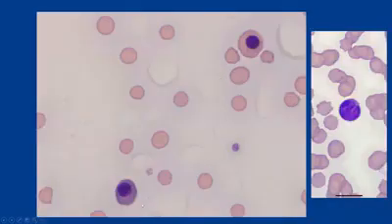All right, so we've got two of these right here. This is an example of a typical small lymphocyte from a cat. It is about the size of a red cell. It has scant basophilic cytoplasm, so not a lot of amount, and a slightly eccentric, round to oval nucleus with fairly clumped chromatin. Then we have these cells, which have more cytoplasm than our typical small lymphocyte. They've got a very dense nucleus that I can barely see the characteristics of because it's so dense. And there's variability in cytoplasm color, from looking the same as a red cell cytoplasm to a more blue-purple color.